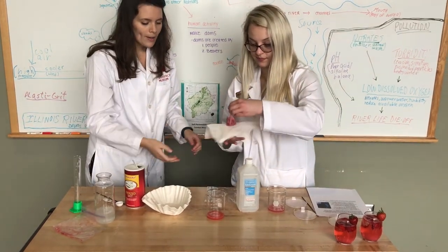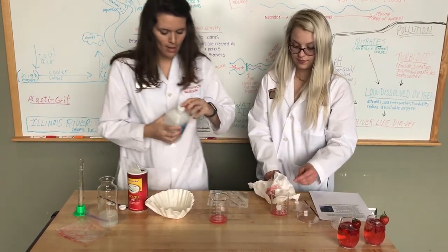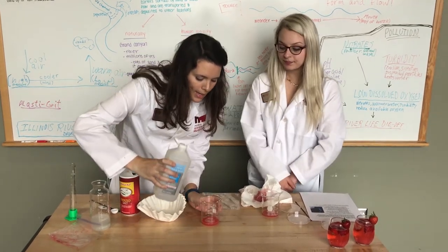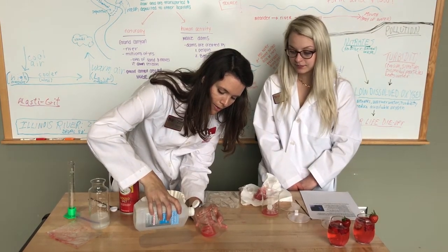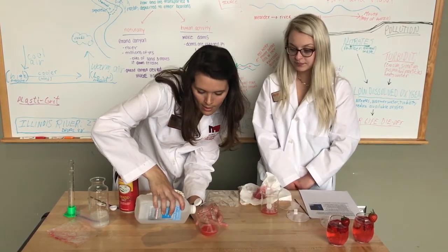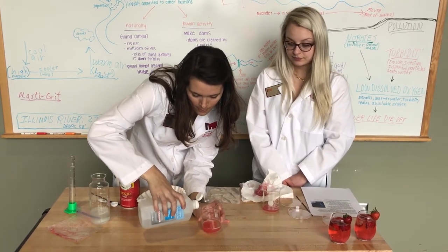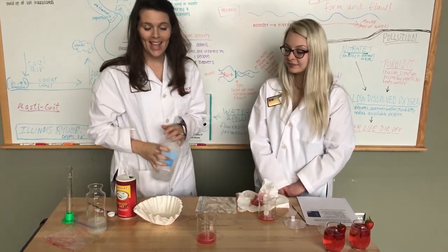So now we've got our liquid in our beaker. The last step is just to add some cold alcohol — rubbing alcohol, 70% isopropyl — and it helps precipitate out the DNA. It helps to pour it on the side of the beaker so you don't disturb the liquid with the DNA in it too much, and you make a nice layer of it on top of your strawberry mixture. In a few minutes you'll start to see some white, stranded material, and that is DNA.